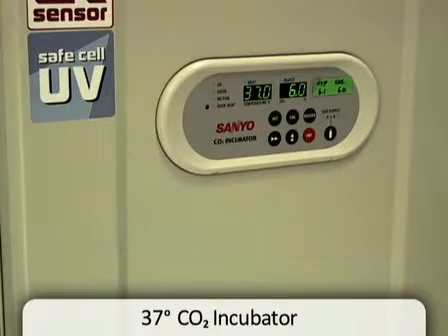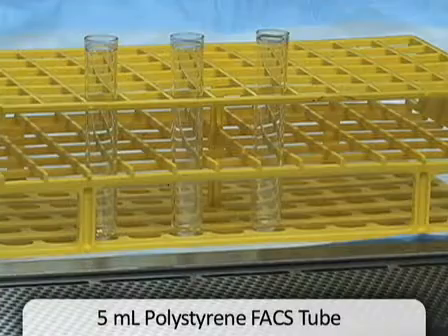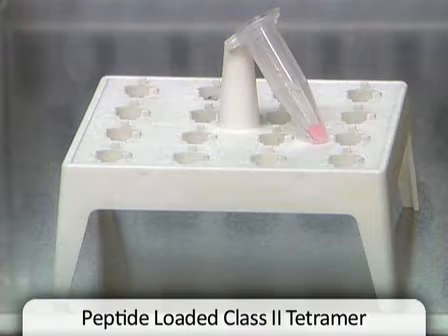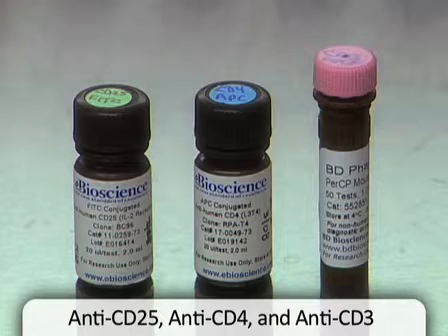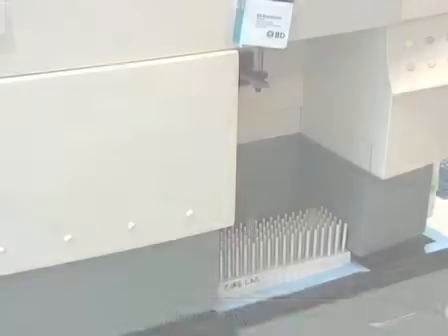37-degree CO2 incubator. 20 milligram per milliliter solution of synthetic peptide containing the epitope of interest. 5 milliliter polystyrene FACS tube. Peptide-loaded class 2 tetramer used to visualize antigen-specific T cells. Anti-CD3, anti-CD4, and anti-CD25 antibodies used for co-staining antigen-specific T cells. FACSCalibur flow cytometer, or equivalent.